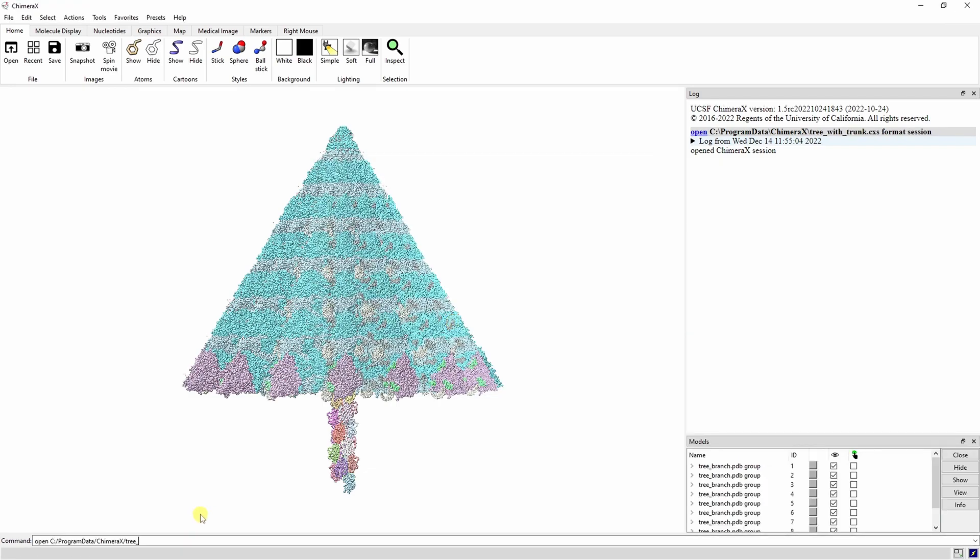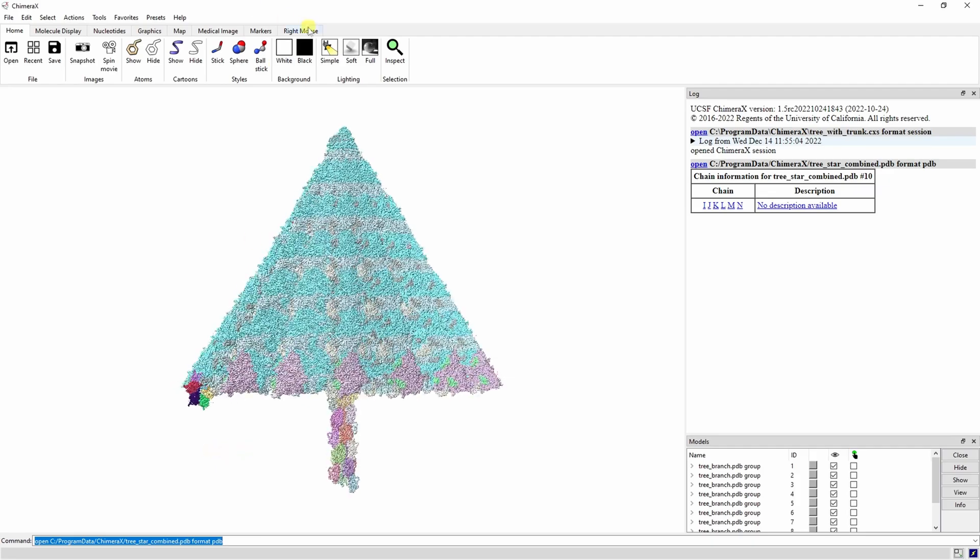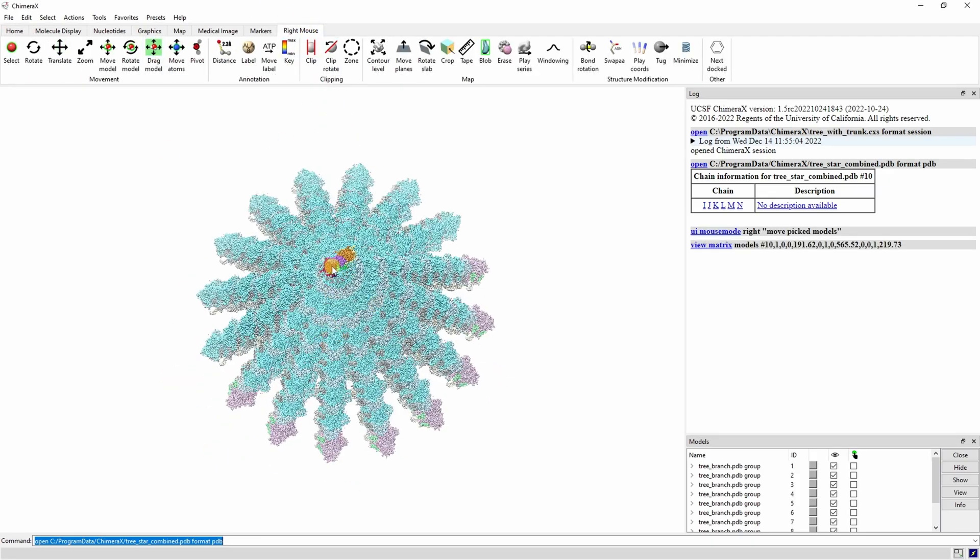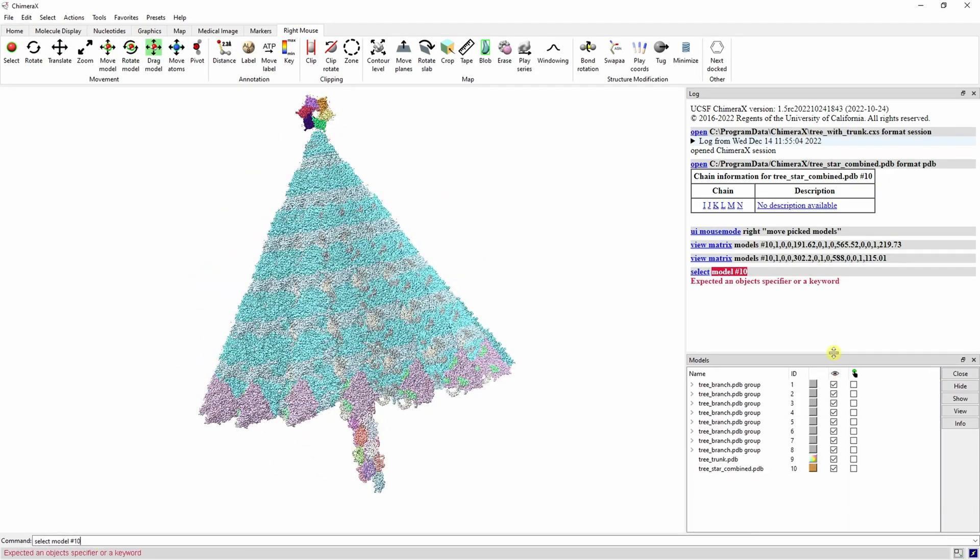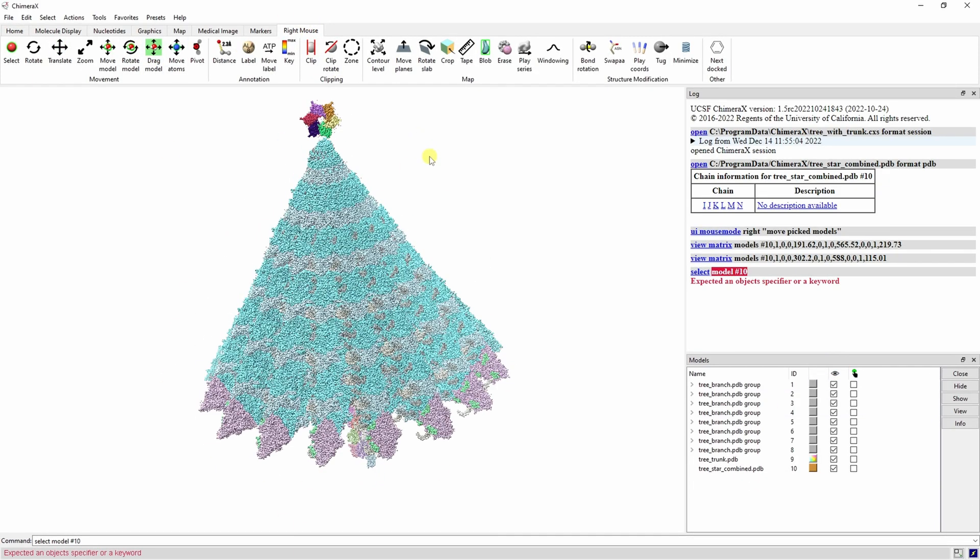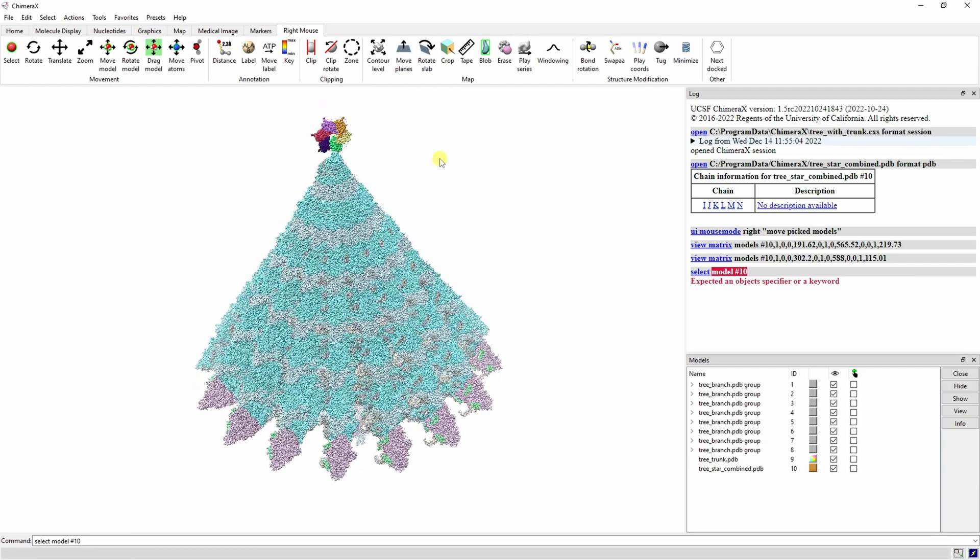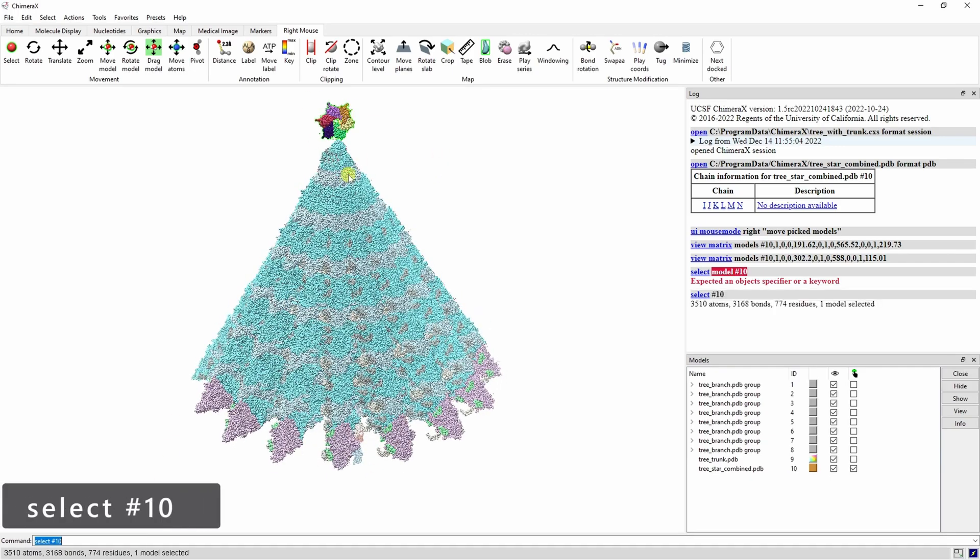Now let's open up the star PDB and drag it to the top of our tree. You can select the star model and use the rotate model option to line it up.